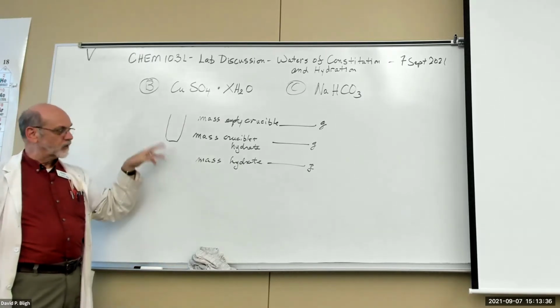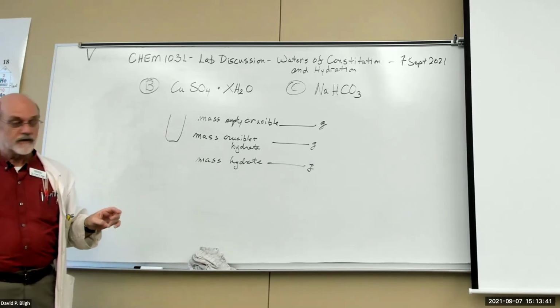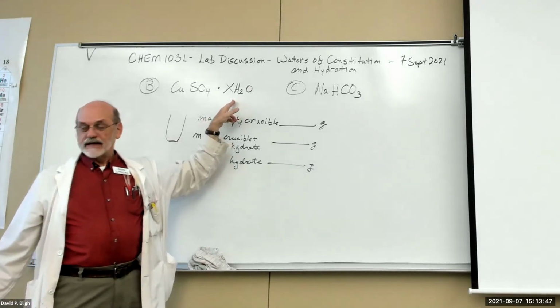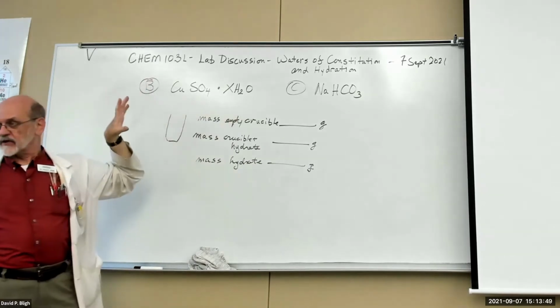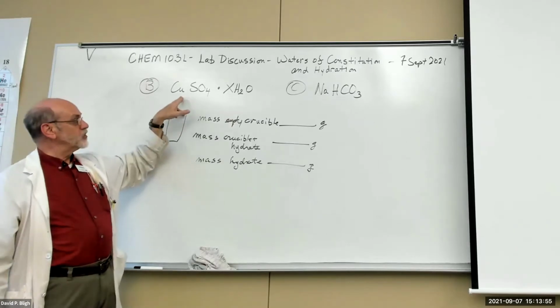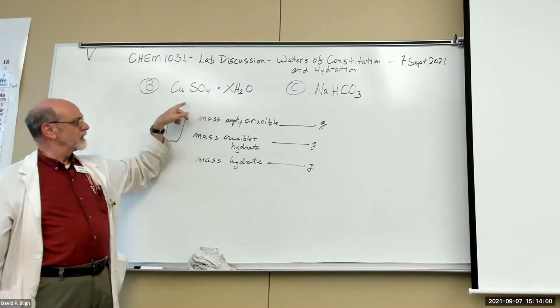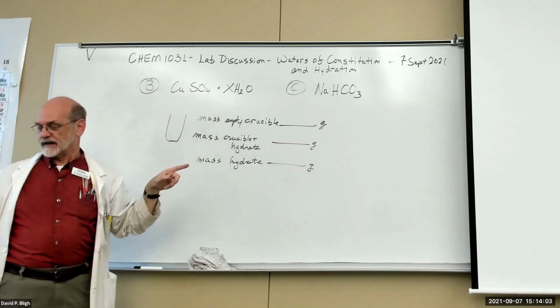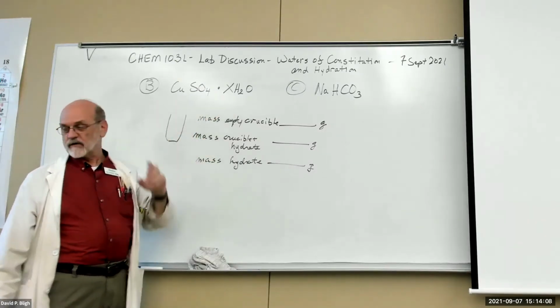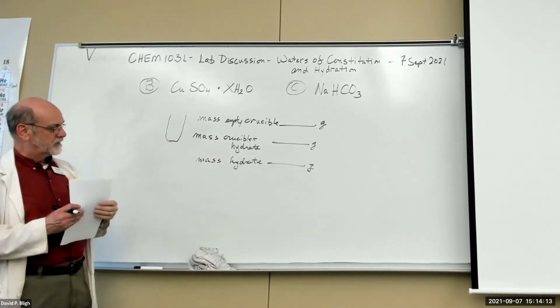So now what we're going to do, we're going to heat it up over an open flame. Okay, what's that going to do? That's going to drive off all of this water. Now, the melting point, the range of temperatures here is very broad, right? It's a very forgiving chemical. You can take this up to pretty high temperature. I forget what it is, 600 or 700 degrees Celsius, before it starts to decompose, right? And then you've got a different reaction. But you can heat it up really high and get rid of all that water. And what do you have left over? Well, now you've got the anhydrate.